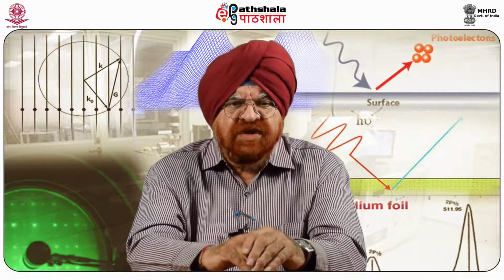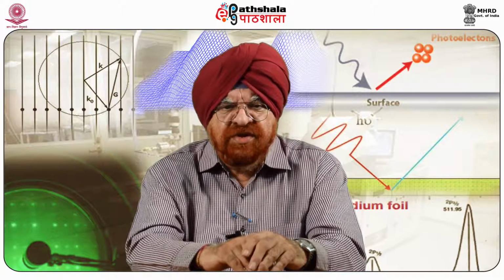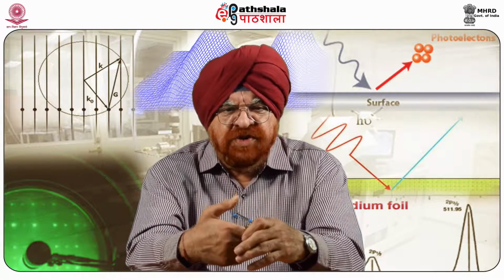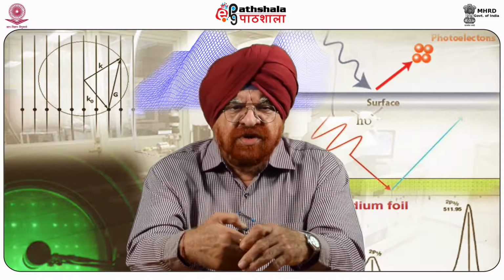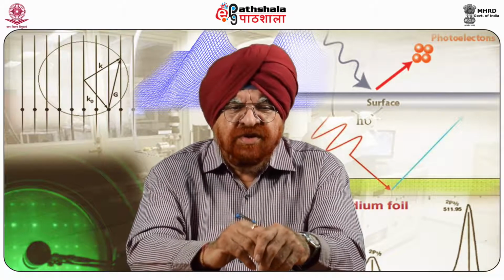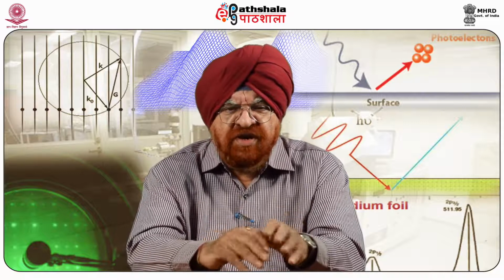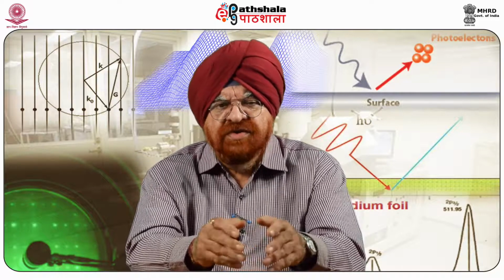Results. As confirmed by the Raman measurements, as the thermal annealing advances, the SiMn samples show crystallization signals along with the growth of randomly dispersed submicrometer structures on the surface of the film. These structures are manganese-containing silicon crystallites surrounded by silicon crystals in all directions, amorphous silicon and MnSi1.7 silicide phase.